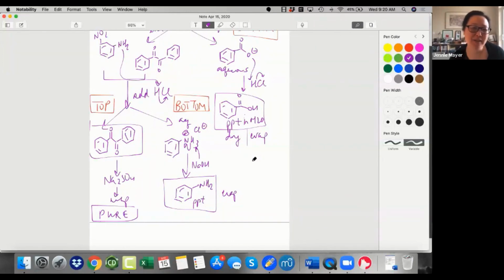I will tell you that you can also use IR to confirm what you have. So I would ask you, which 2 compounds in the end would you give me, and how would you know that those were the compounds you gave me? Of course you could talk about melting point, look up the melting point, tell me what it would be, and then think about the IR and tell me what signals you would see in the IR to confirm.